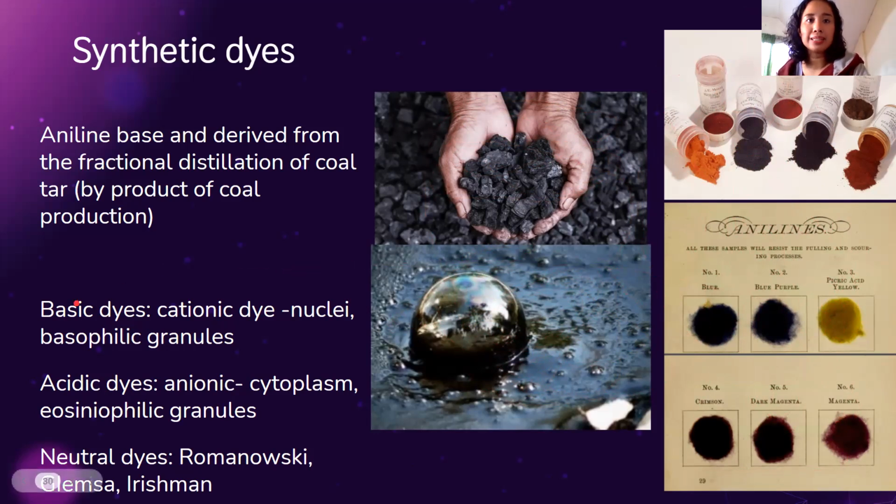So yan, basic dyes, acidic dyes, and neutral dyes. Example, Romanowsky-Giemsa. Giemsa pang blood.